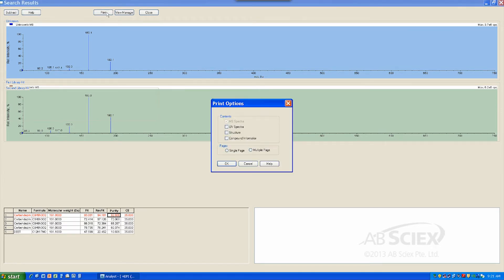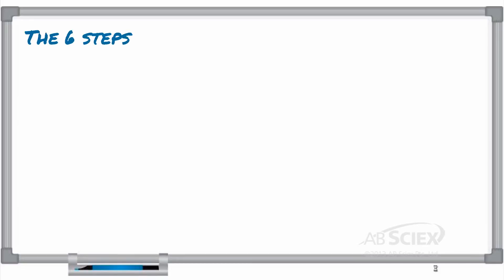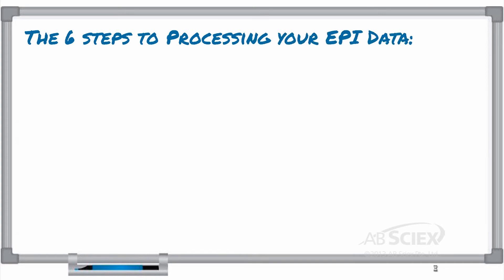Step 6: Print your library search results or record results for your records. In these six easy steps, you are able to use your MRM-EPI scan data to perform a library search to verify the identification of any positive peaks that you may have found in your unknown sample.